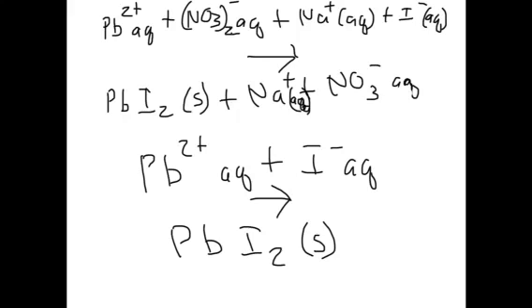And then for develop a hypothesis, it says based on the results of this lab, develop a hypothesis to explain how the stoichiometry could determine a reaction that forms a gas, for example calcium carbonate and hydrochloric acid, instead of a precipitate. Well, we know that through stoich we can convert into nearly anything.